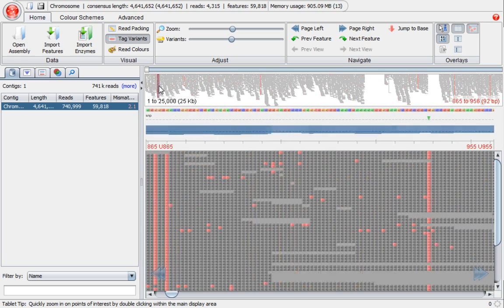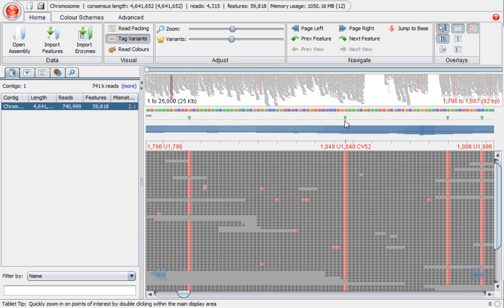So now I can scroll around, find the variants I want, see the tags, right click, and see what is available. Just hovering over the green triangle will pop up a pop-up. You can't see it on the video. It's something to do with how it captures the information from the screen, but that tells you what the various parameters for that particular snip are. You can see the whole of the VCF entry for that particular line.